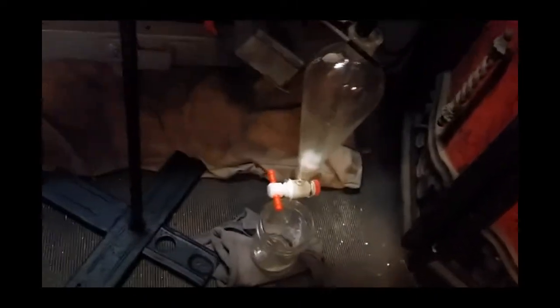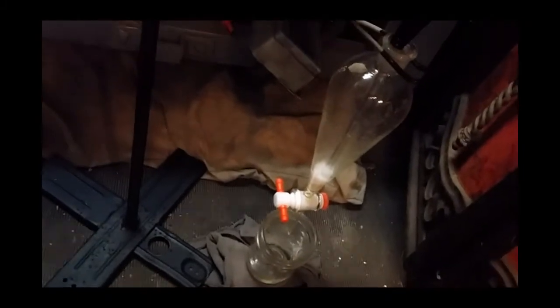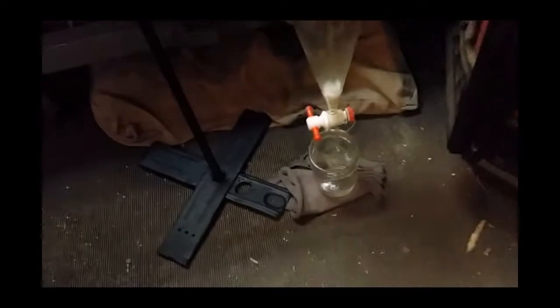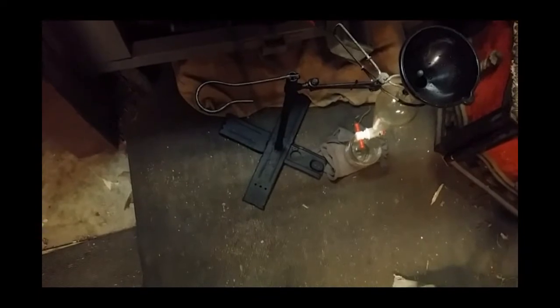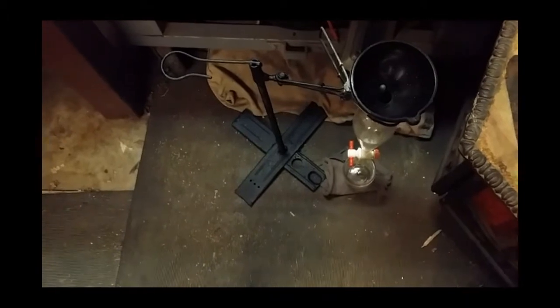This is my filtration setup. Just a separatory funnel, the valve, and a cotton filter. So if there's any more solids, what I'll end up doing is just pouring it into here, which I used prior. Like I said, I've already taken some of the solids out of there a couple times. Collect it in that. Add some distilled water if necessary, and just evaporate it from there. If I see more solids, I'll add more distilled water and just keep doing it until I get pretty pure chloroauric acid. It's about the only choice that I have in order to deal with that.